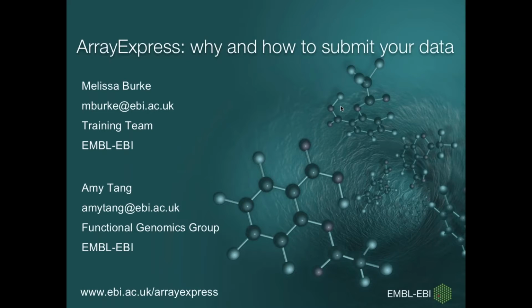So as you can see, the topic of today's webinar is ArrayExpress, why and how to submit your data. But instead of being a step-by-step tutorial of how to submit your data, what I'm going to try and do is to get you thinking about why you need to be sharing your data, what makes a good submission, and then I'll point out a few things that can help make your submission a bit easier.